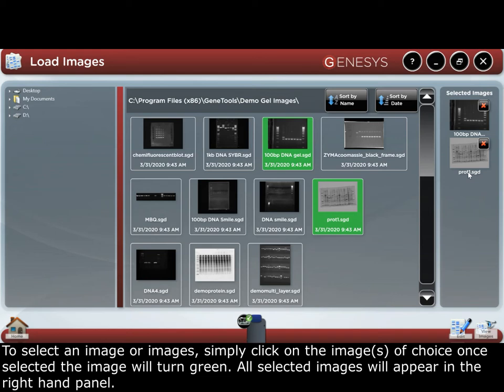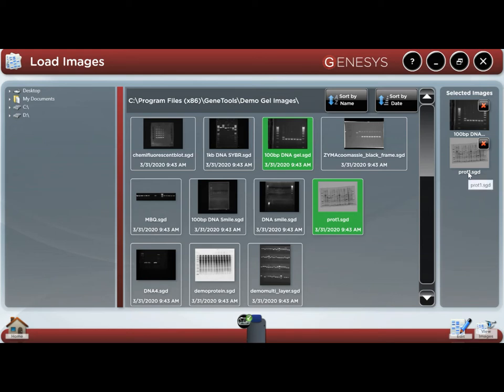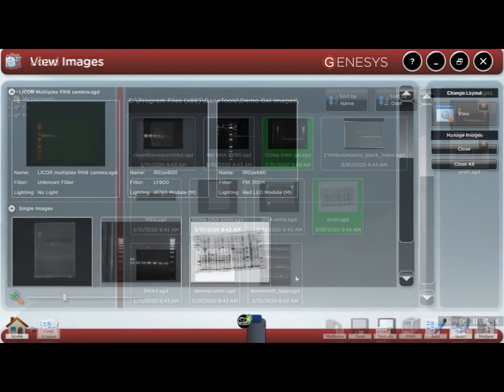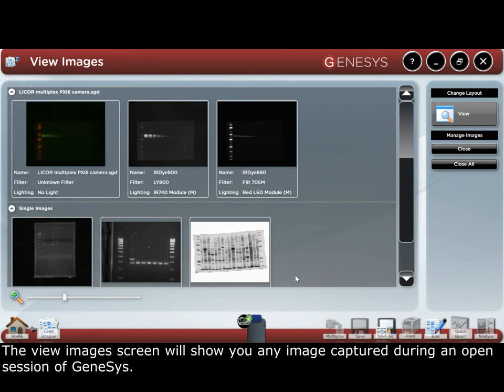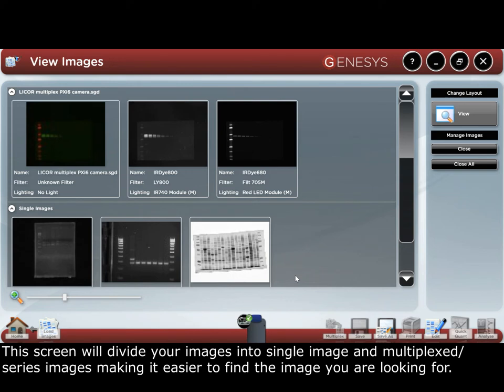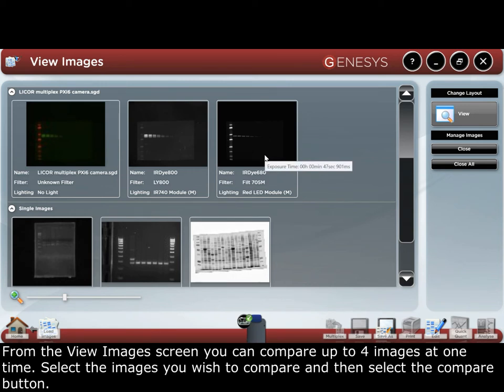All selected images will appear in the right-hand panel. The view images screen will show you any image captured during an open session of Genesis. This screen will divide your images into single image and multiplex or series images, making it easier to find the image you were looking for. From the view images screen you can compare up to 4 images at one time.